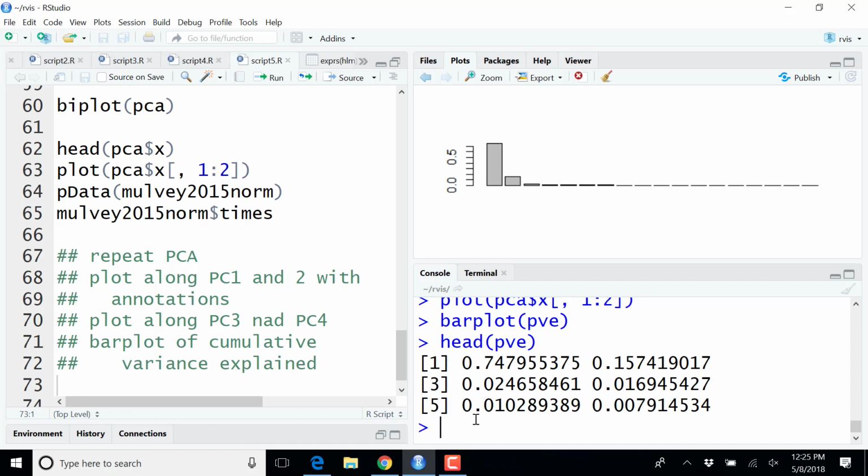Oh, I see what you mean. Yes. So PC1 and PC2 might be all over the place, but PC1 and PC3 might actually separate. So PC2 will always explain more variability than PC3. But you might have some resolution along PC3 that you do not have along PC2 and PC1. Yes, absolutely. So depending on what you have here, two principal components might not be enough. Then you will need to look along four principal components.